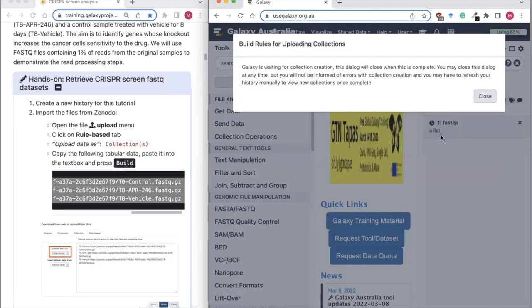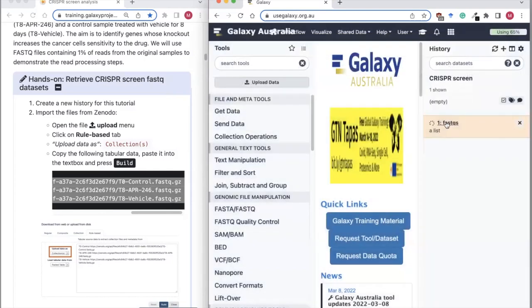You should see it appearing in your history. At the moment it's gray, which means it's a job waiting to upload. When it starts uploading it'll turn yellow, and when it's finished it'll be green. Now it's turned yellow — I can close this off. It's uploading there as a list, which is what a collection is — like a folder containing multiple files.